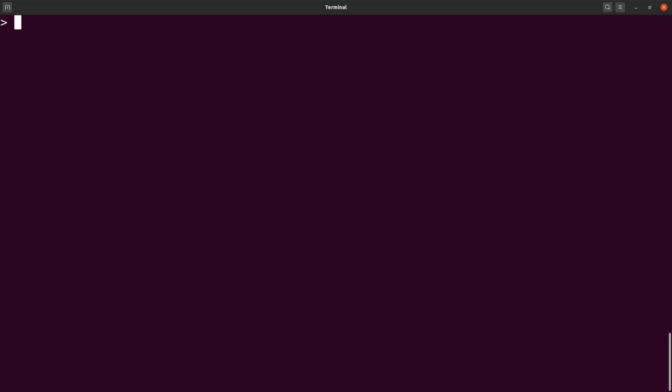So let's load them. So we say pheno data, and then we read the data. So there's a CSV file, so we use read.csv, this function here, to do that. So what we are doing is to assign the entire operation to this variable. Let's load it and you'll see what I'm talking about. So we have read.csv, and then we specify the path.